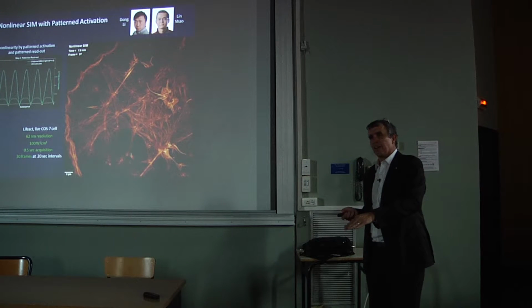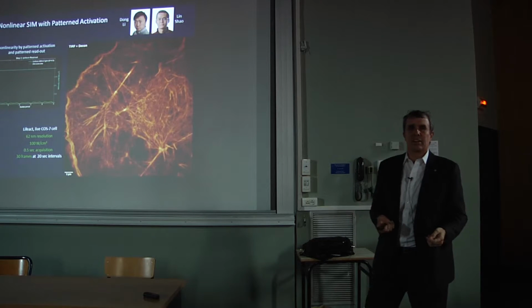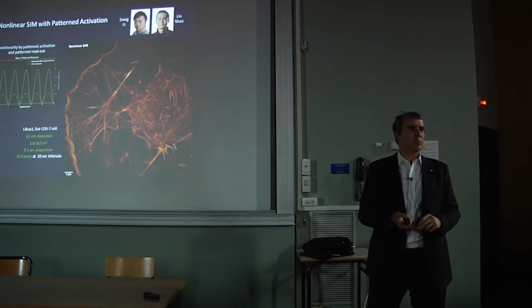Furthermore, it takes a lot of energy to bring the molecules up and down. And second, it takes a lot of time. And time and energy are the enemies of live cell imaging.